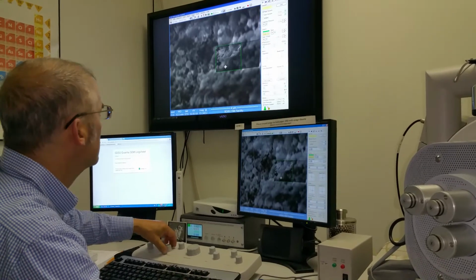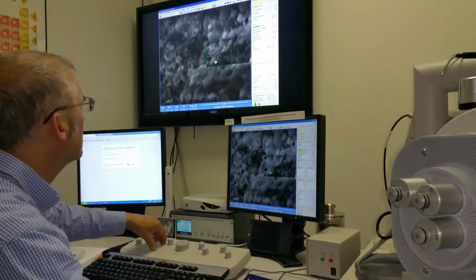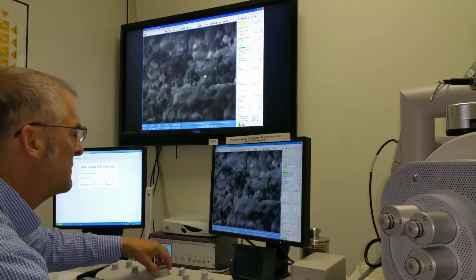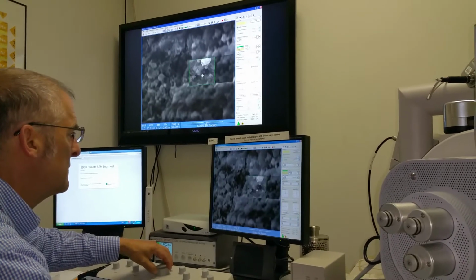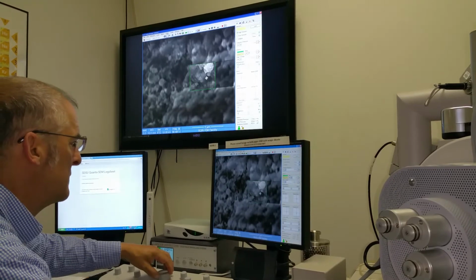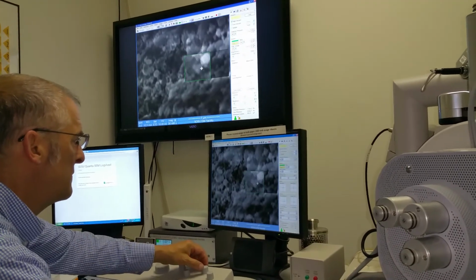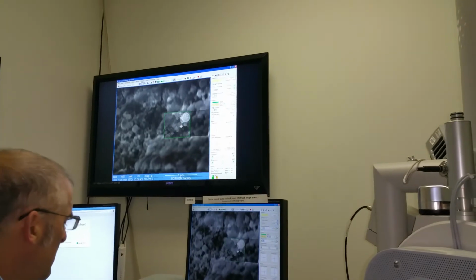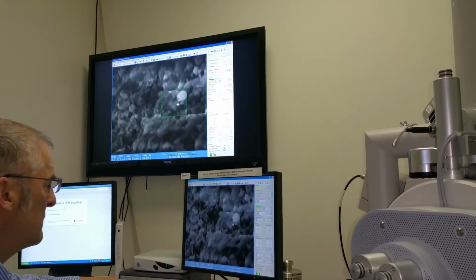This is actually the other sample. Oh, this is the other sample. So this is a CO2 sample that was condensed from CO2 gas back into a carbon structure. And we're going to find out what this carbon structure is made of and some of the components of it.